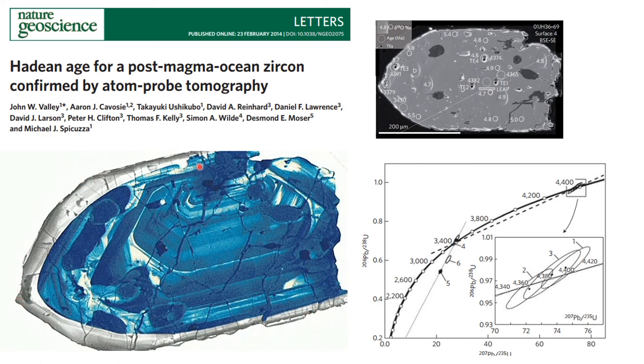But inside this, you can see very clearly that there's some compositional zoning. You can see that this part of the crystal here clearly grew before the stuff outside it. And you can see that there are some resorption surfaces, some inclusions perhaps, and then there's this layer on the outside which is very different in composition. The colour difference here isn't real, but it's been highlighted to show that there's this rim on the outside which is still zircon, but it is different from the inside.